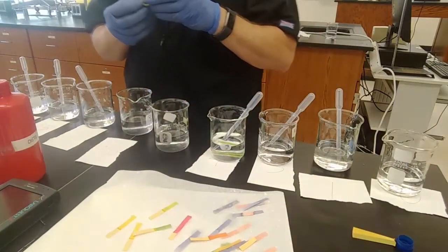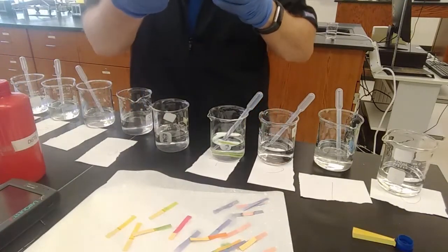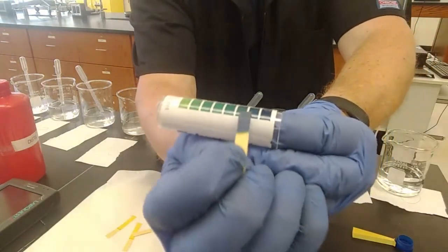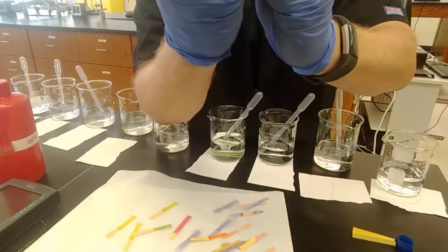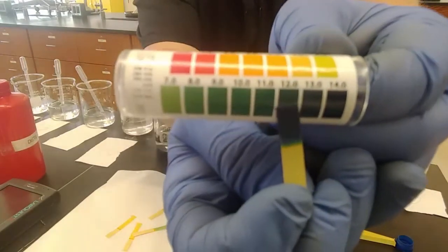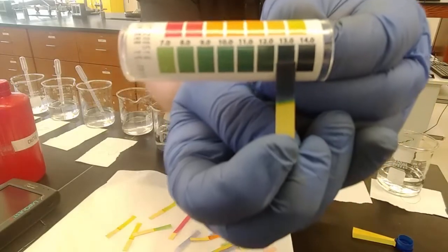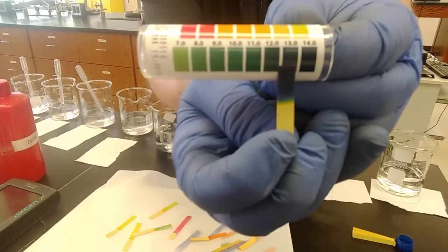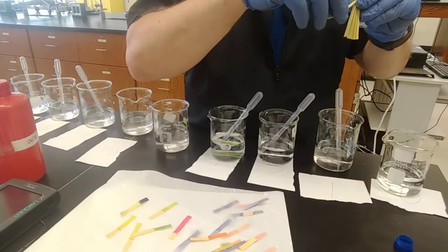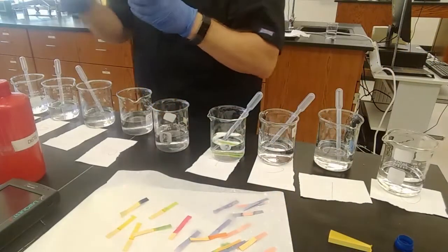13 should definitely be basic, according to everything we've seen so far. And look at that. Yeah, I'd say it's a 13. Right? Not quite a 12. I'd say it's a 13. So our pH strip seems to confirm that we were expecting a 13. 14 is hard to tell any difference from 13. It's just even darker. Let's find out.